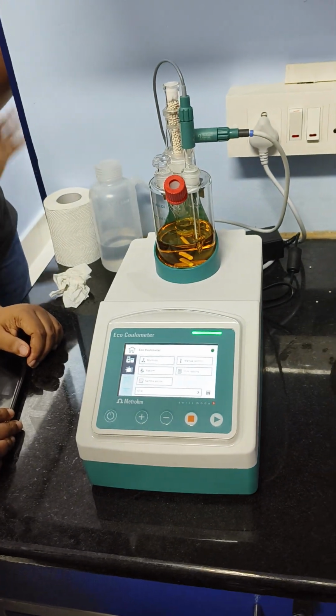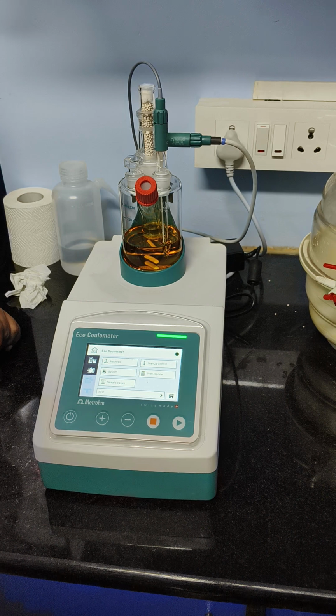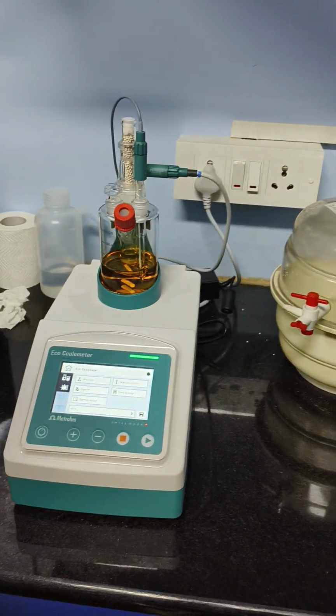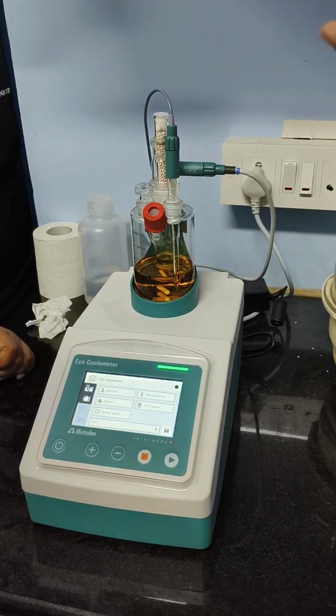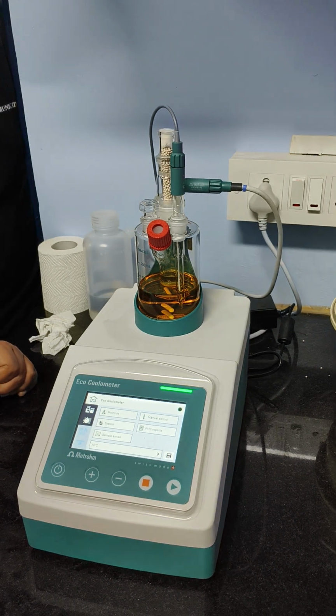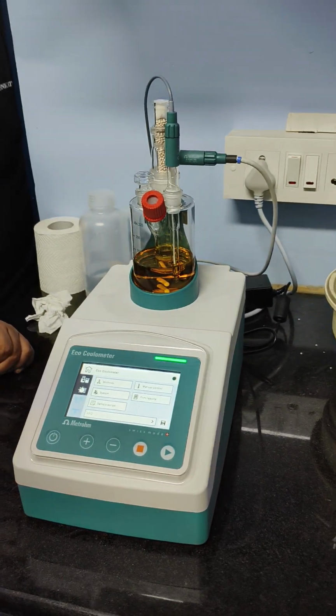For any kind of measurement, there are two types. One is called an absolute measurement, the other is called a relative measurement. The relative measurement you do with reference to some kind of standard. That is called a relative measurement. When you say absolute measurement, that means you don't have any standardization procedure.